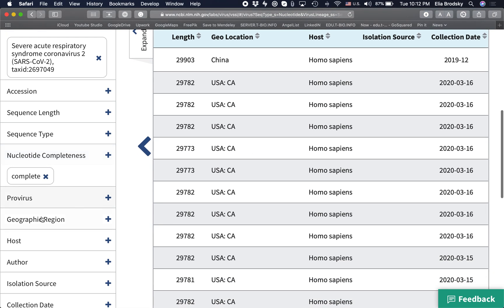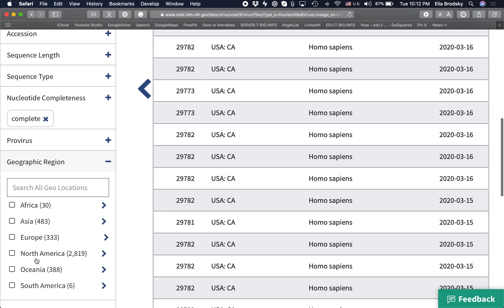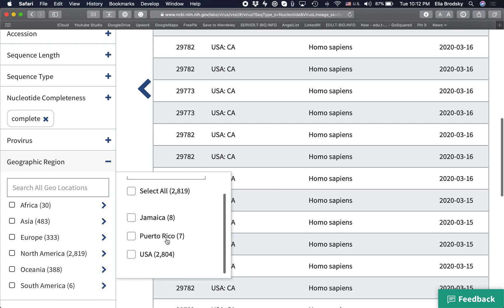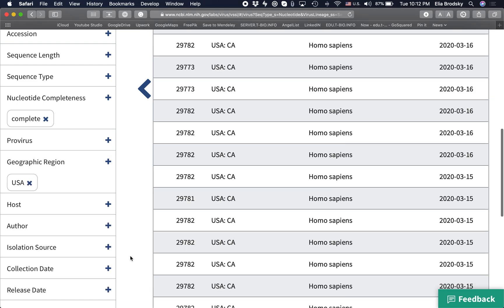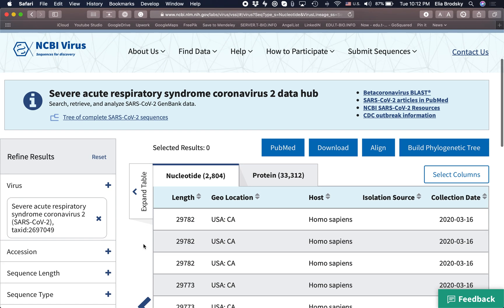You can also go to geographic region and, for example, just select all of those that are in the US. There are over 2,800 nucleotide sequences in the US alone.